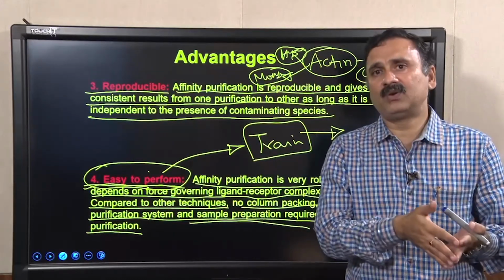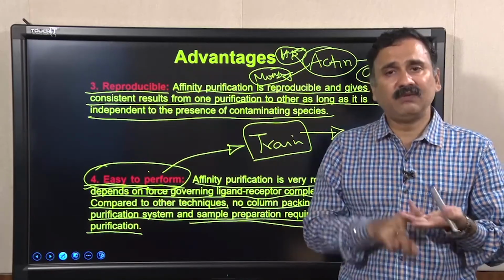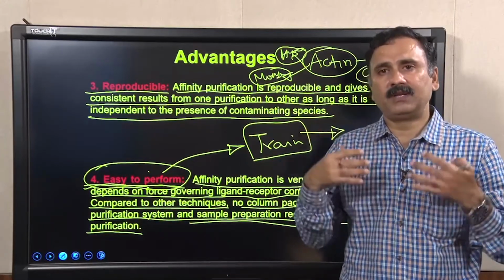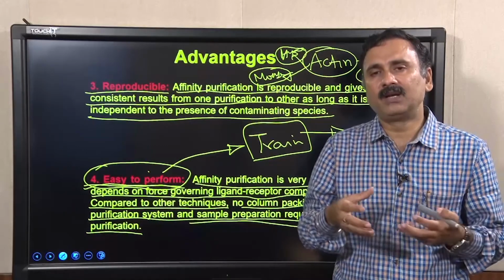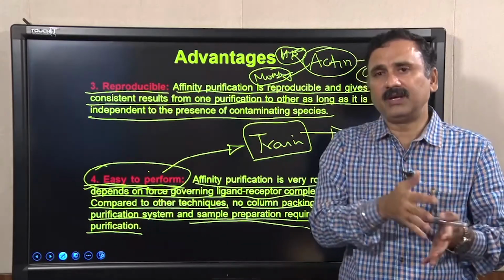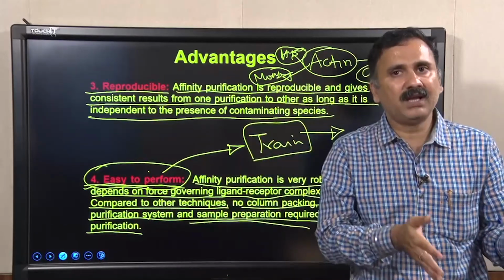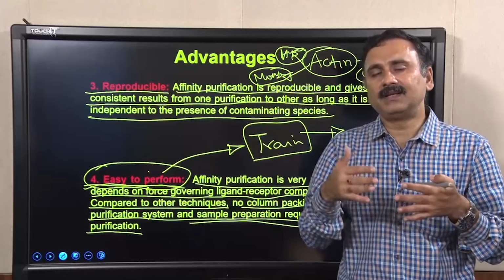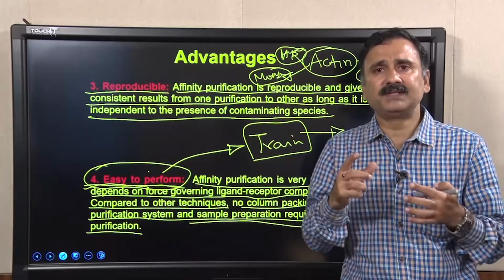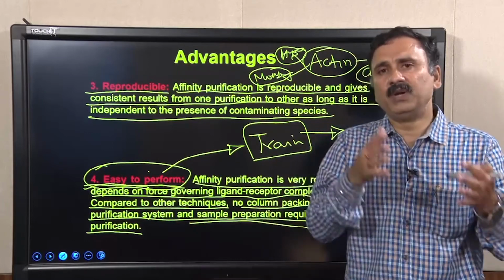Whereas, in all other chromatography techniques, if it is ion exchange chromatography, hydrophobic interaction chromatography or gel filtration chromatography, the person has to know what the molecular properties are and how to exploit those molecular properties, how to set up the gradient, whether I should use the step gradient or the linear gradient, and so on. So, these are the gradients, and all of this requires a very experienced person to perform those chromatography techniques to purify the proteins.